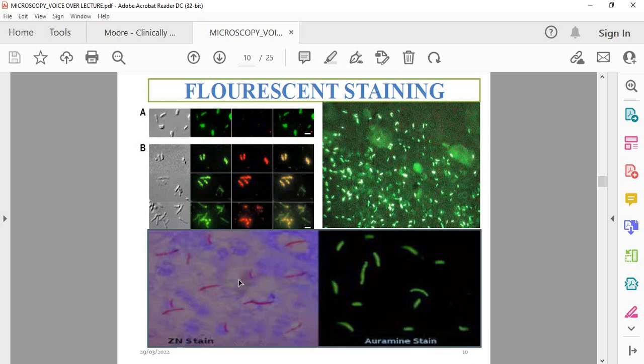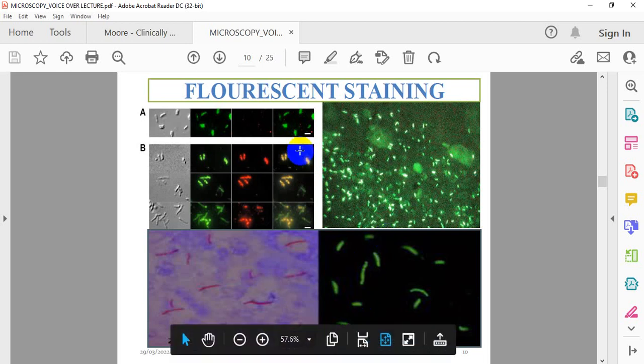This one we use for TB stains. Is it methylene blue, carbol fuchsin, then the alcohol or the decolorizer? That one is different from this. This one you just purely use what? A fluorophore or fluorescent dye to stain. You can see that it's very clear compared to this one. I brought this one. This is not a fluorescent stain, but all the rest are fluorescent stains.